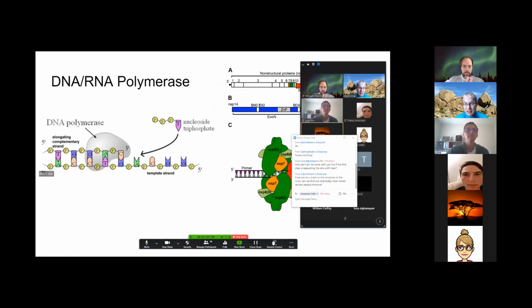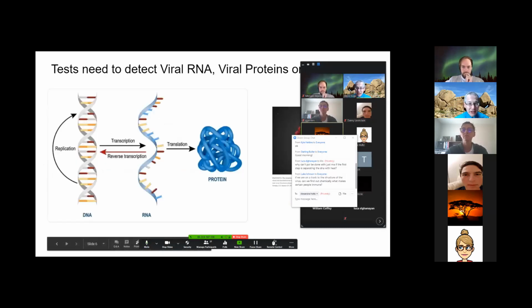It cannot copy RNA. If we were using the virus polymerase, we could just start with the RNA because that's what it does. It makes RNA out of RNA. So since PCR has been really well established with that polymerase from the thermophilic bacterium, that's where we need this additional step with the virus RNA.